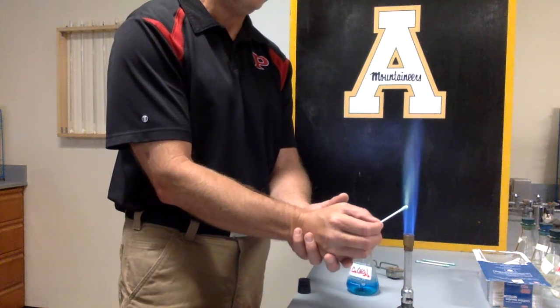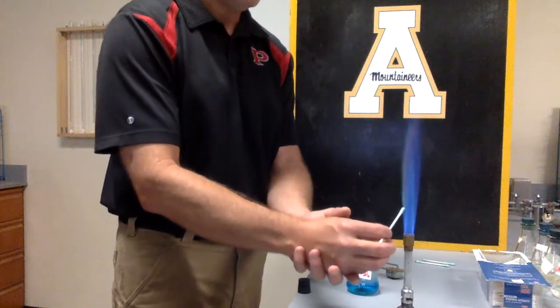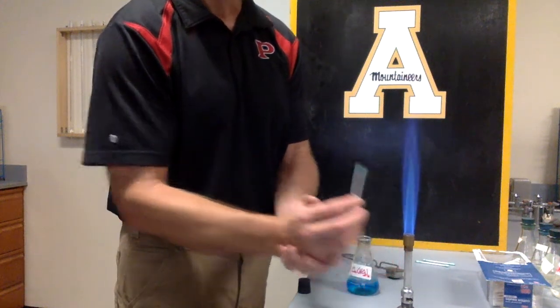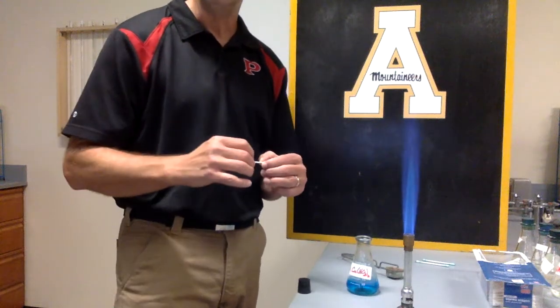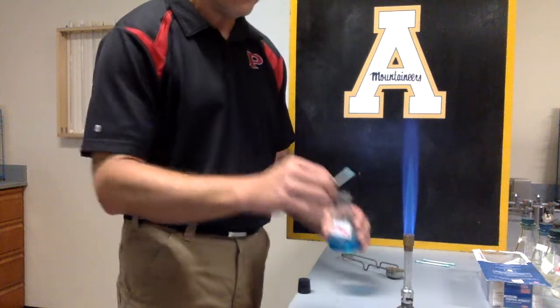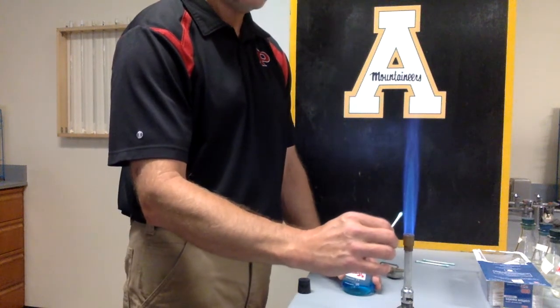You can see it almost immediately starts flaming up, and you can see that it flames up a nice, pretty color, and that color is what you're supposed to record. So I'm going to do it again. That one was pretty quick. All right, so here we go again.